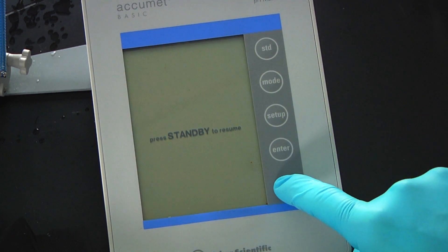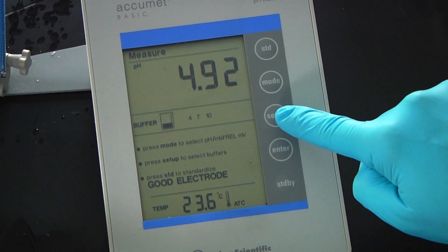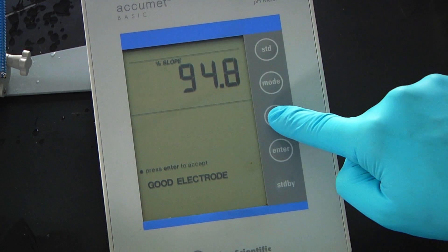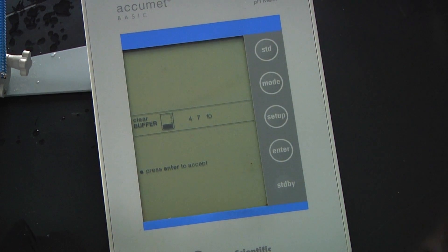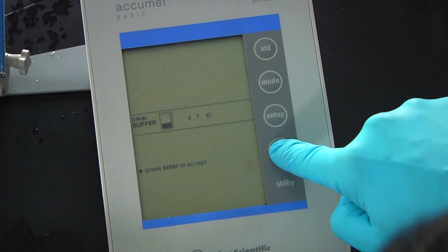First, we need to purge the pH meter to erase the previous calibration. Press the setup key twice. Press enter to clear the previous calibration.